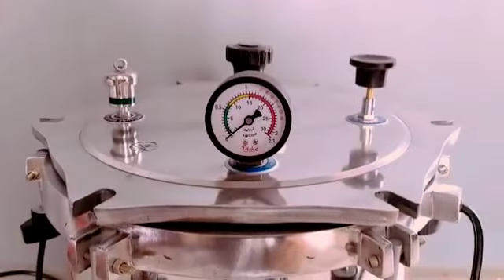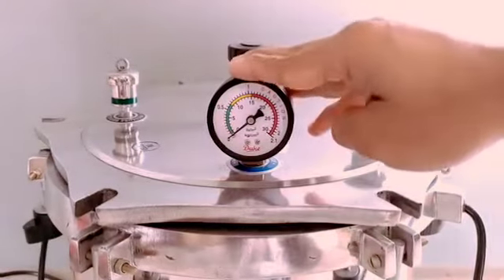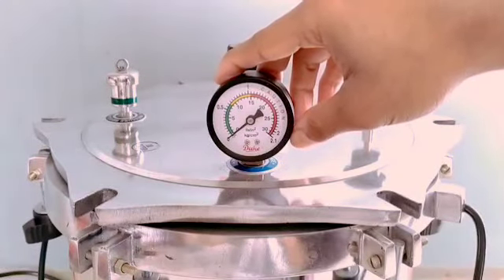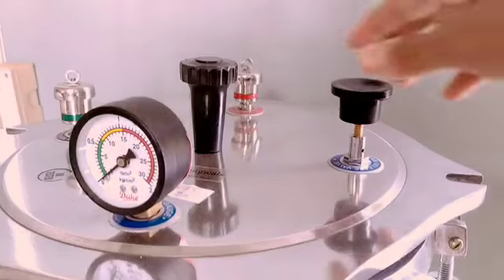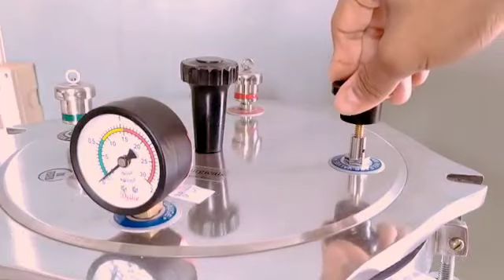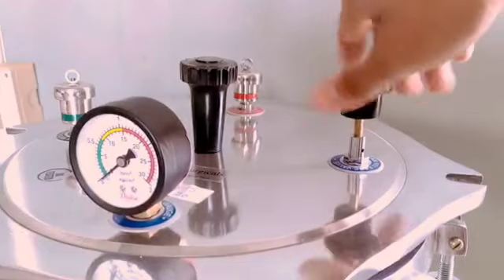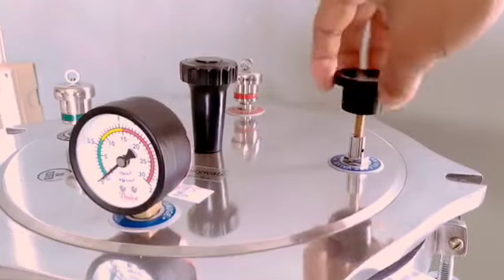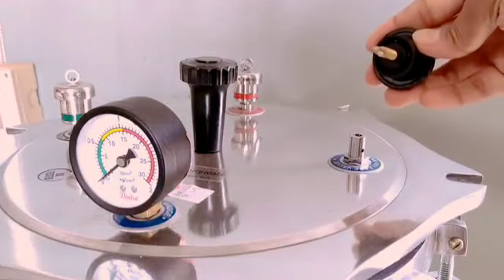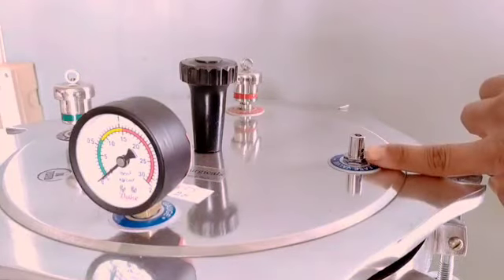A typical pressure cooker type autoclave steam sterilizer has the following main components: pressure gauge, which gives you the real-time pressure in pounds per square inch of the autoclave chamber; steam release or air exhaust valve. This is the outlet valve for complete removal of any enclosed air within the chamber at the very beginning of the sterilization process. Removal of residual air from the chamber results in a complete replacement of the air with steam or water vapor. This allows for a thorough and effective steam sterilization, as the name suggests.